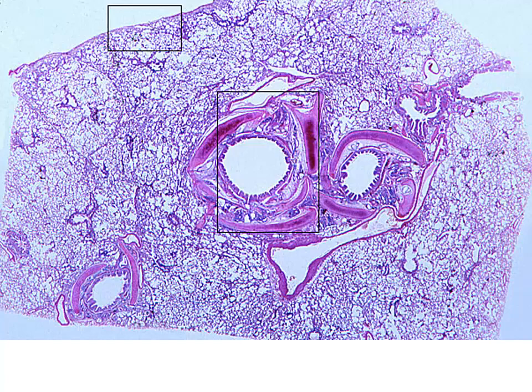Now, so far we have been looking at the extrapulmonary structures. Now we are looking at the intrapulmonary. We saw this in lecture as we look at our bronchus versus bronchiole. The bronchus, remember, is going to have the cartilaginous plates. And we can see that in this case, this bronchus has cartilaginous plates completely surrounding it. And at this histological level, we're simply going to call this an intrapulmonary bronchus since we are within the lung tissue itself.